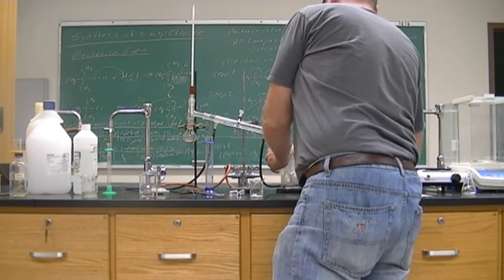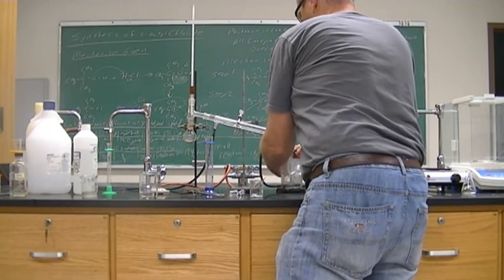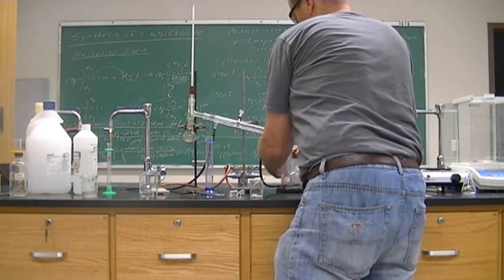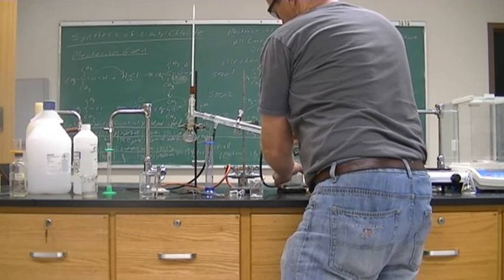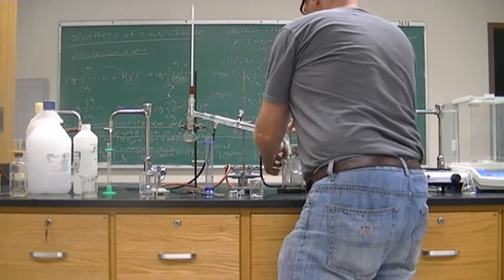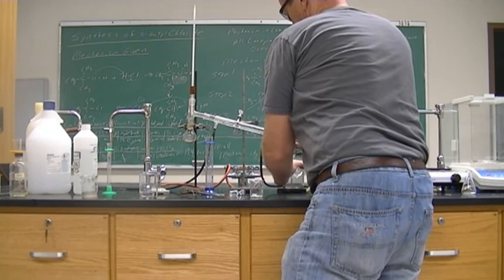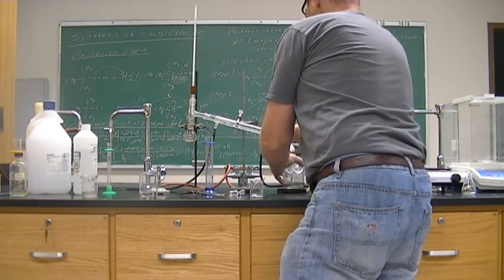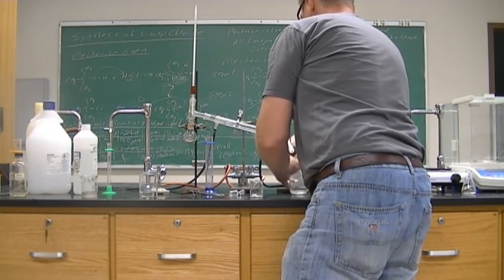anything inside of here. So we will remove our clamp here, which will allow us to collect the product.